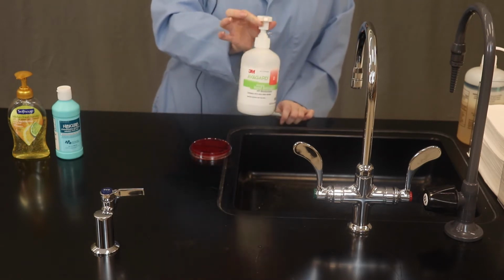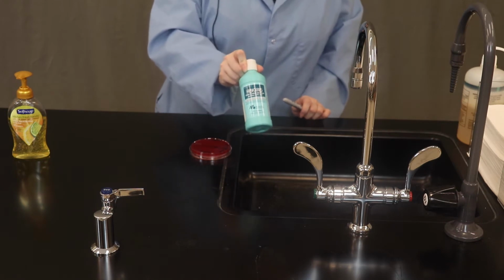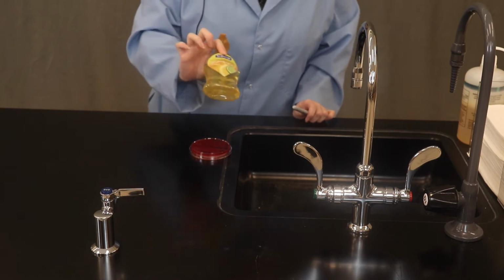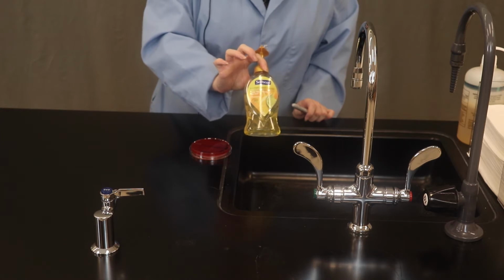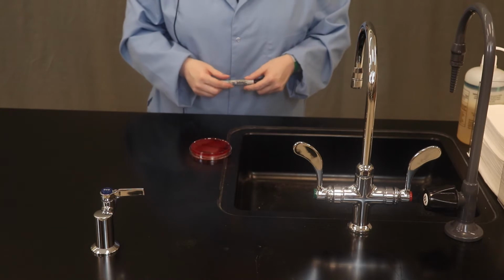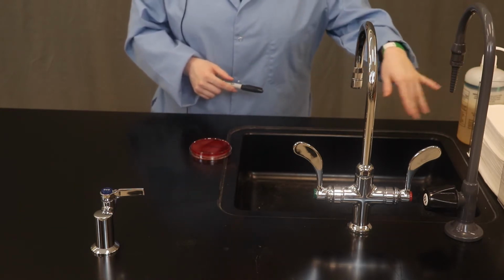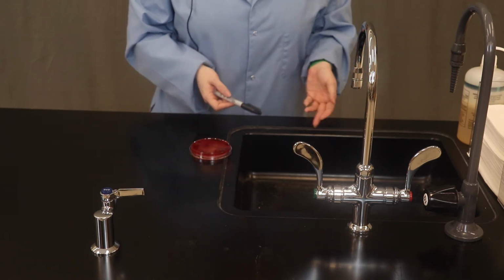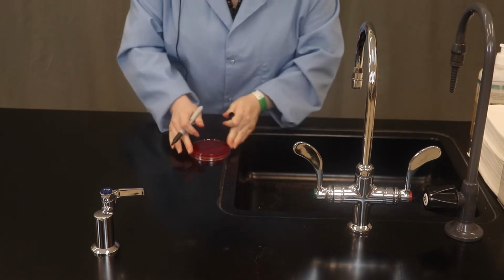Hand sanitizers, lots of variety of these. Hibiclens, we're going to learn about this when we cover chemical methods of control, or you've already heard about it. And then this is just regular soap, so no antimicrobial properties. You could experiment with other things such as time, whether or not you use paper towels, etc. In this experiment, I'm going to pick one variable, and my variable here is going to be soap, antibacterial strength. So I'm going to write that on my plate.